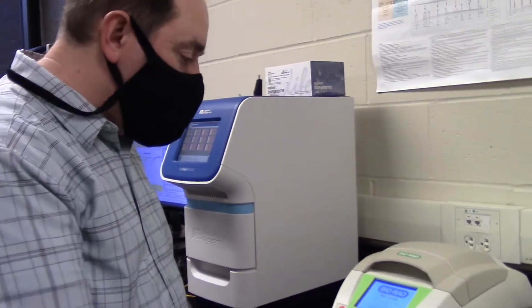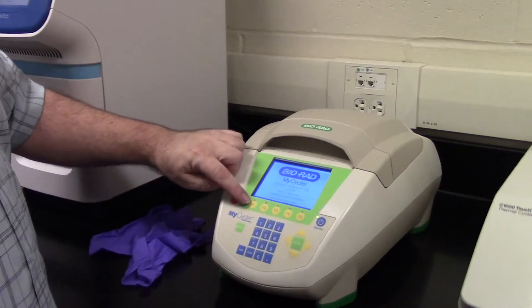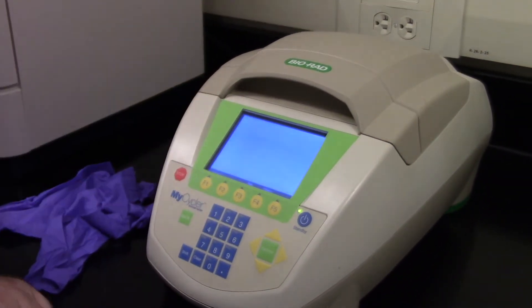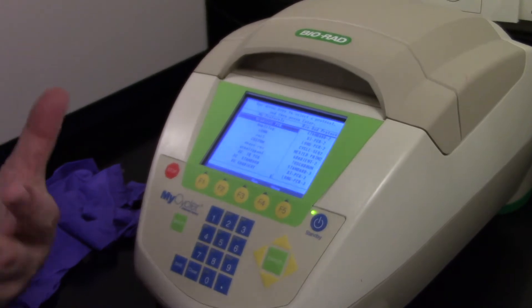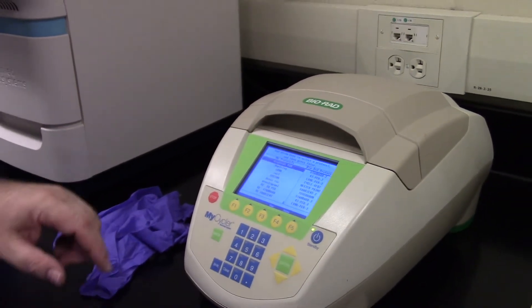Now let me show you how to find the protocol. If you look at the screen here, F1 is for a protocol library. I'll push F1, and it gives us a list of things that Dr. Storer, Dr. Lowe, Dr. Leonardo, Dr. Rikosian, and I have already programmed into the machine.